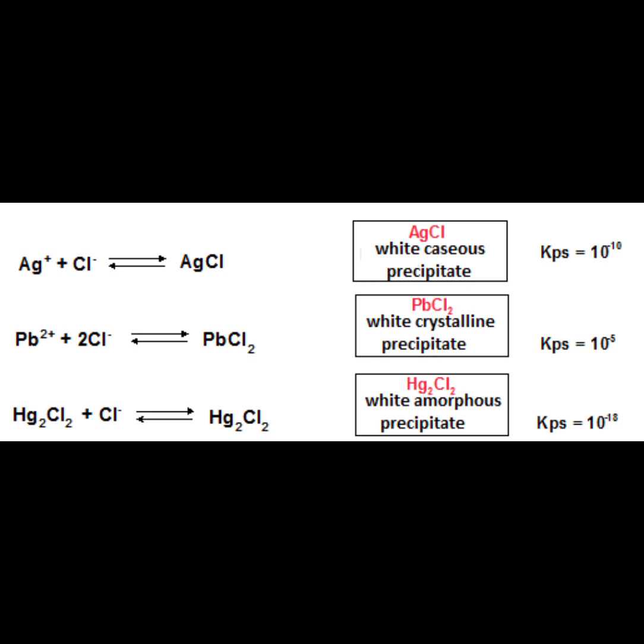To separate the precipitate from the supernatant, the precipitate is washed with water with a few drops of 2N hydrochloric acid. This will eliminate impurities in the precipitate without solubilizing the chlorides again. That's why it is added with some hydrochloric acid.